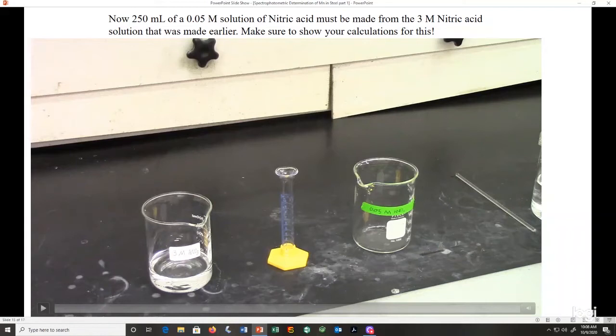Now 250 milliliters of a 0.05 molar solution of nitric acid must be made from the 3 molar nitric acid solution that was made earlier. Make sure to show your calculations for this.